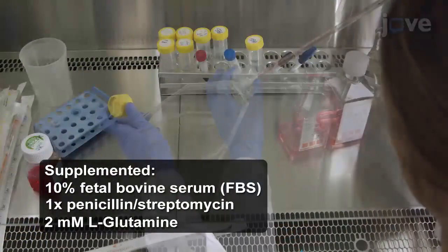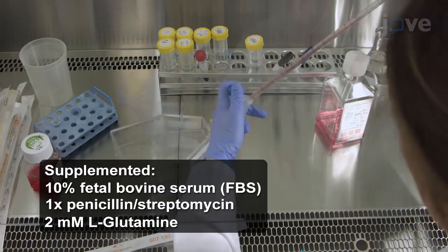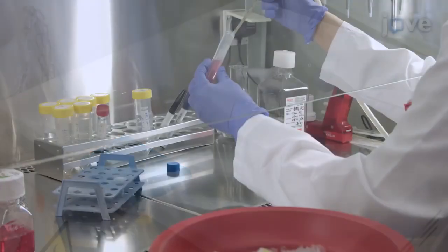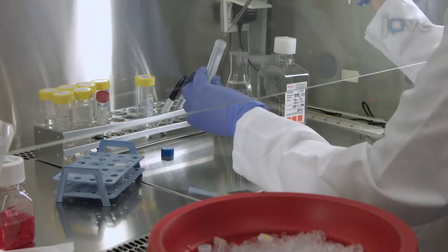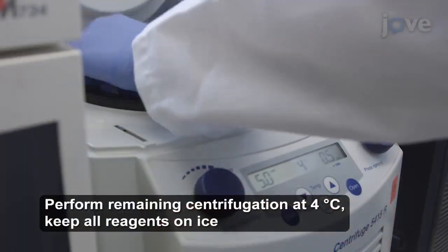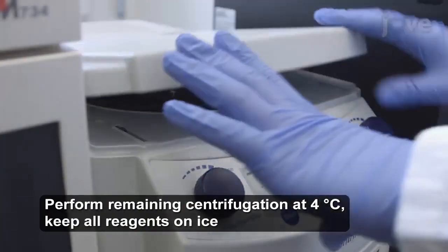Add 7 milliliters of supplemented RPMI 1640 medium, collect the cells in a 15 milliliter tube, and spin them down at 200 times G for 5 minutes. Then, aspirate the medium and resuspend the cell pellet with 1.5 milliliters of 1X PBS, then transfer the cells into a 1.5 milliliter microcentrifuge tube. Spin down the cells again at 500 times G and 4 degrees Celsius for 5 minutes.